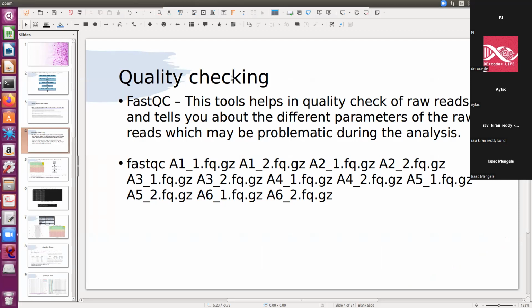Actually, I'm using a Linux platform, and the files are in the form of a RAR folder, so I have to install one software to unpack them. For that, I'm doing it. It will take a little time. I have installed it, and I have to use the rar command. Should I wait for you or proceed? You can move on from FastQC. I will do it; in maybe 7 minutes it will be done. Okay, you can move further, no problem.